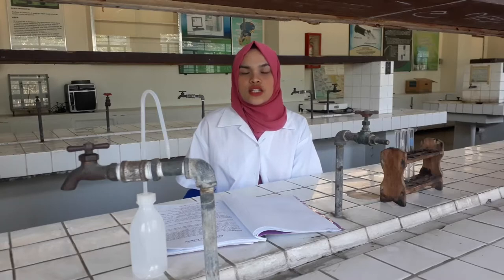Lucas reagent is a solution of saturated and anhydrous zinc chloride in concentrated hydrochloric acid. This test is used to distinguish between water-soluble primary, secondary, and tertiary alcohols. Some alcohols react with ZnCl2, or zinc chloride, in acidic aqueous solution to give an alkyl chloride. The Lucas test involves a substitution reaction where the OH group of the alcohol is replaced by a Cl atom. The Lucas reagent consists of a mixture of hydrochloric acid and zinc chloride that are dissolved in water.